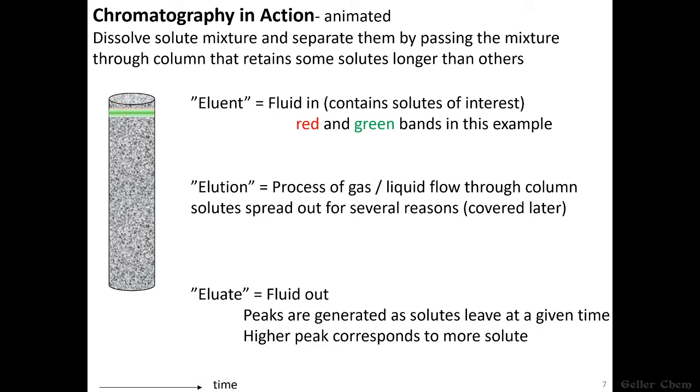Let's see that again. Right now, everything's compact. Green starts to move faster than red, but we can see green is spreading out more and more, as are the red chemicals. And now red comes out, and finally red stops coming out.